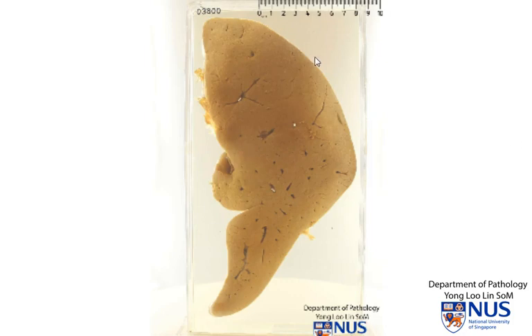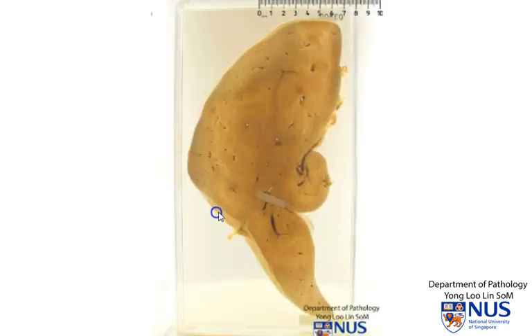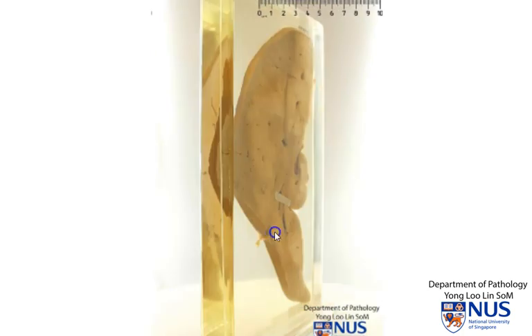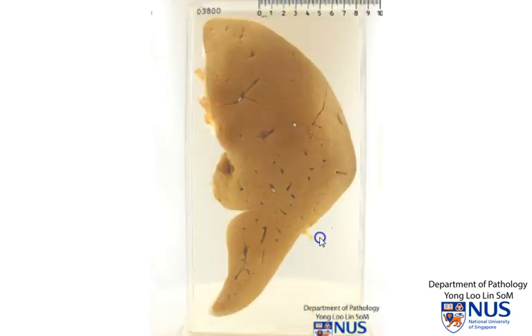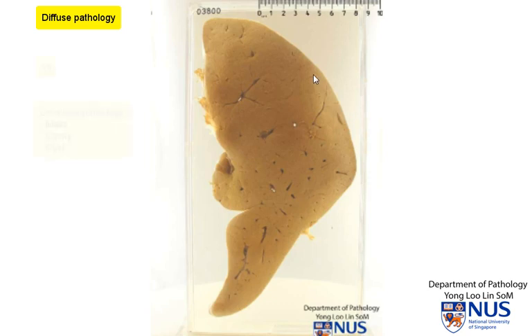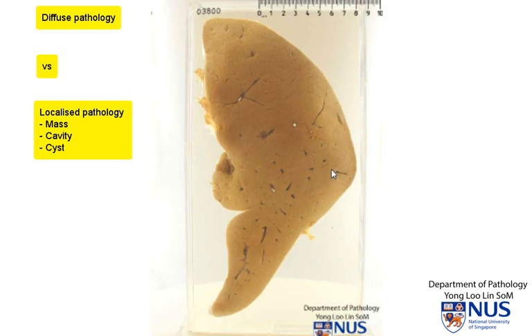Here we're looking at a slice of liver, and I'm going to turn this around so that you can look at the opposite surface. Inspecting this grossly, we can see that the pathology is diffusely involving the entire liver. One of the first points of decision is to decide whether the pathology is a diffuse one, as it is in this case, or a localized one — meaning in the form of a mass, nodule, cavity, or cyst. In this instance, we don't see any discrete or localized lesions, and therefore this is a diffuse pathological process.